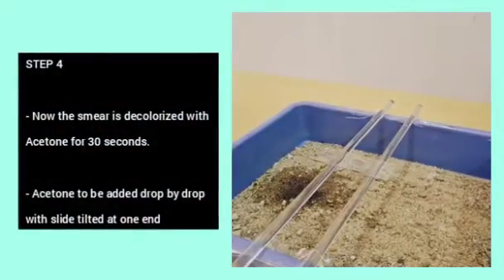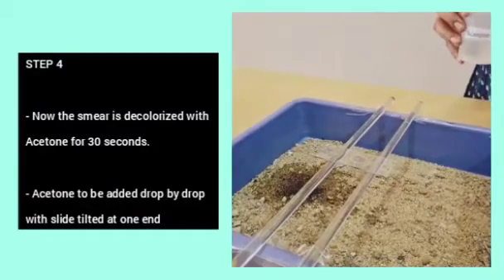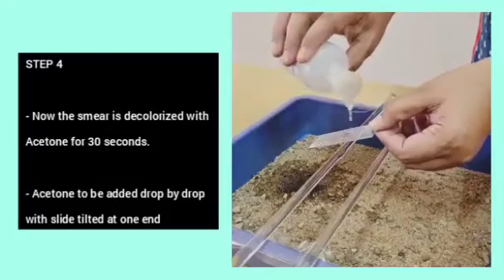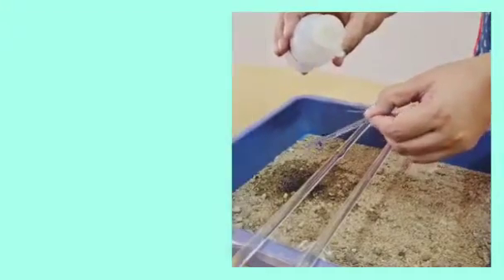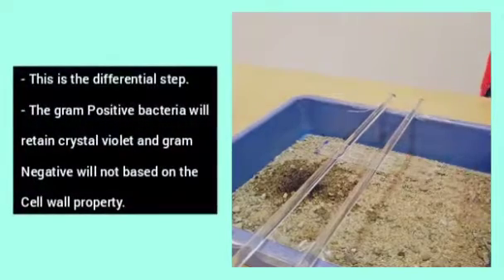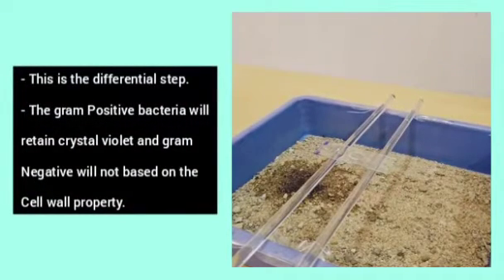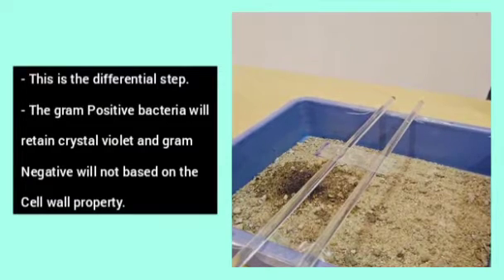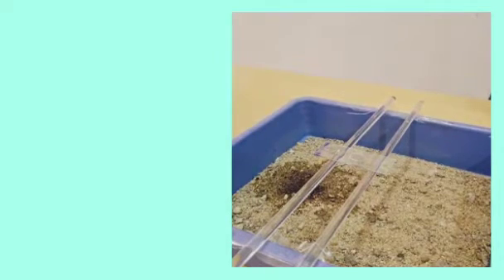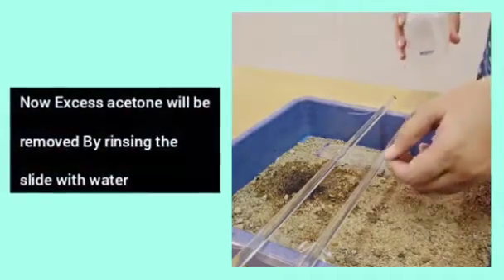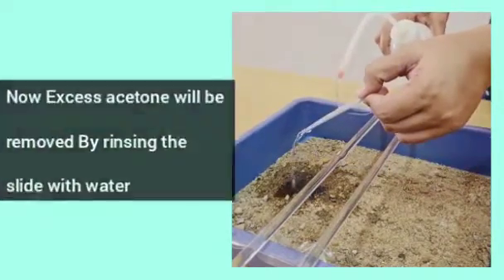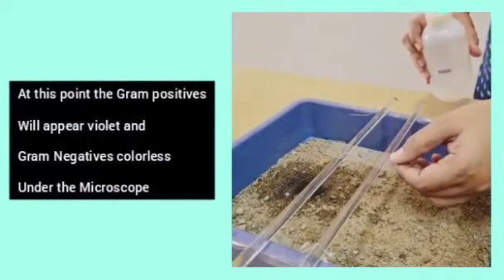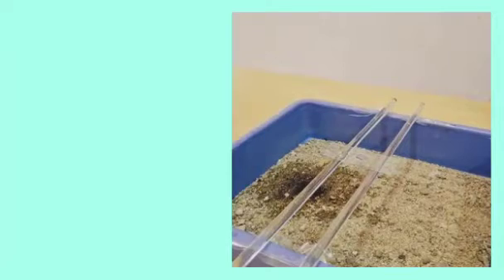Step 4. Now, the smear is decolorized with acetone for 30 seconds. Acetone to be added drop by drop with slide tilted at one end. This is the differential step. The gram positive bacteria will retain the crystal violet and gram negative will not based on the cell wall property. Now, excess acetone will be removed by rinsing the slide with water. At this point, the gram positives will appear violet and gram negatives colorless under the microscope.